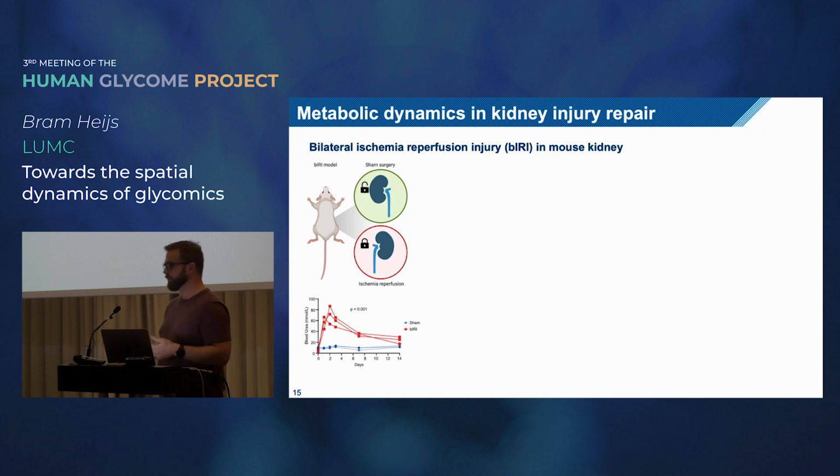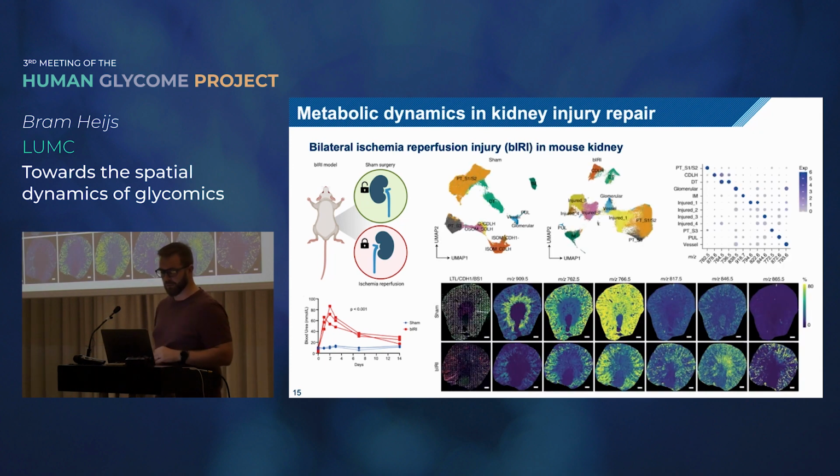And these kidneys were then processed with this entire procedure of vibratome sectioning, tissue culture, and then followed by mass spectrometry imaging analysis. So now we look at the lipid profiles of those 2 groups of kidneys. So we have the sham group and the IRI group. And basically we find that some clusters are present in both. So we have healthy proximal tubules present in both. We have a glomerular cluster of pixels present in both. We have some distal tubules.